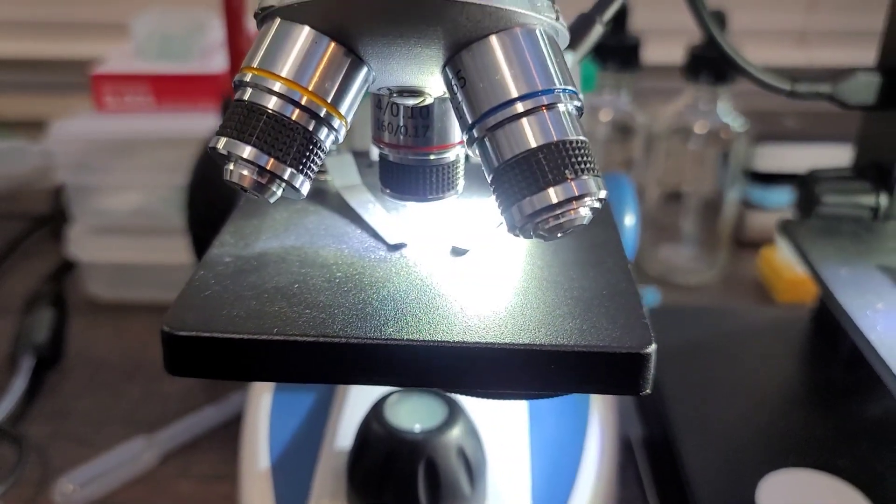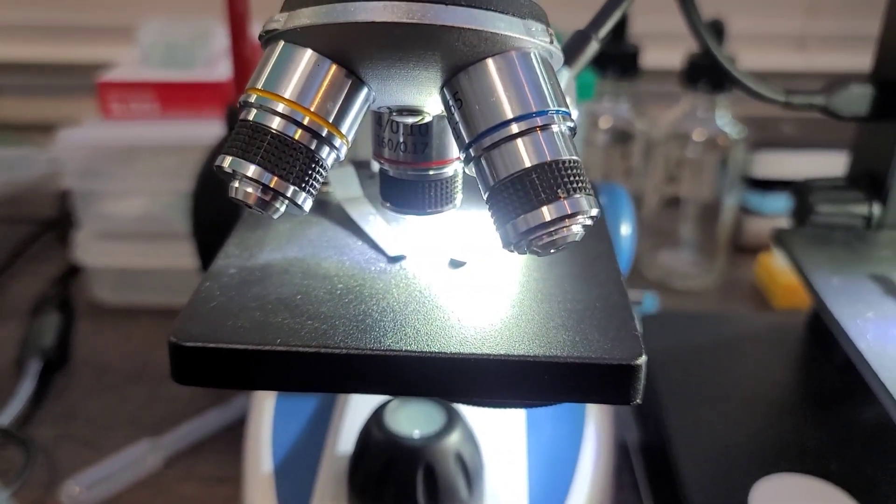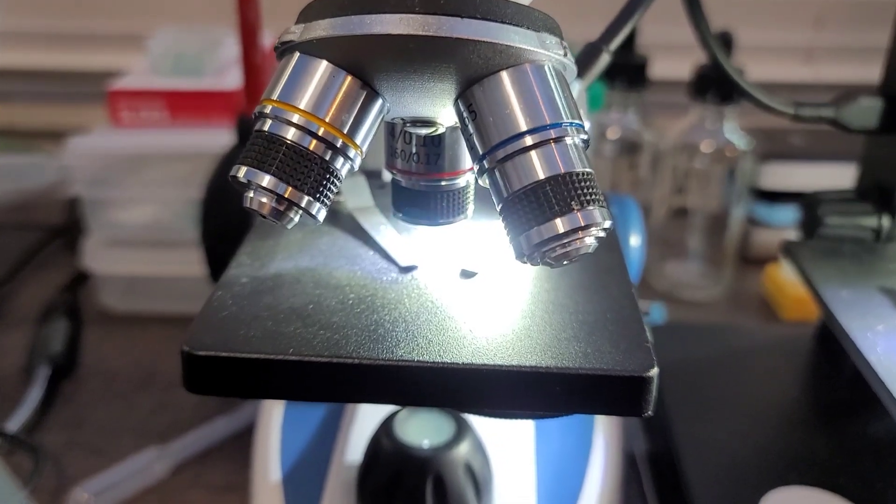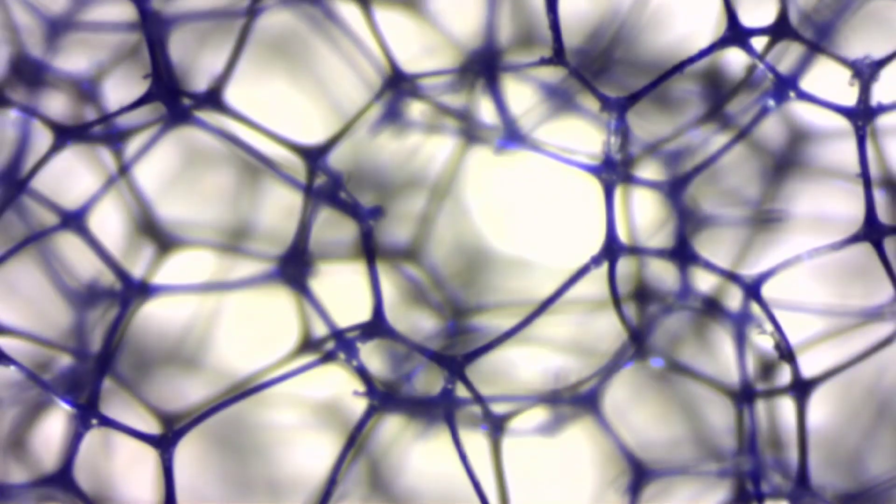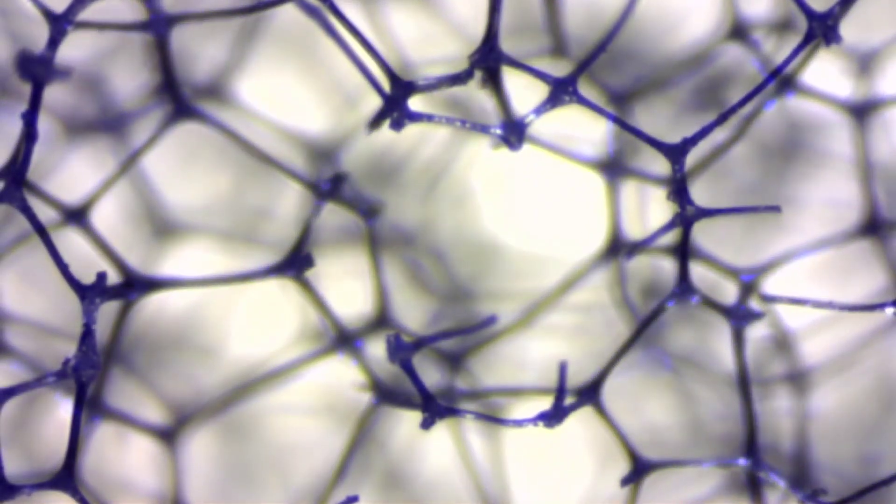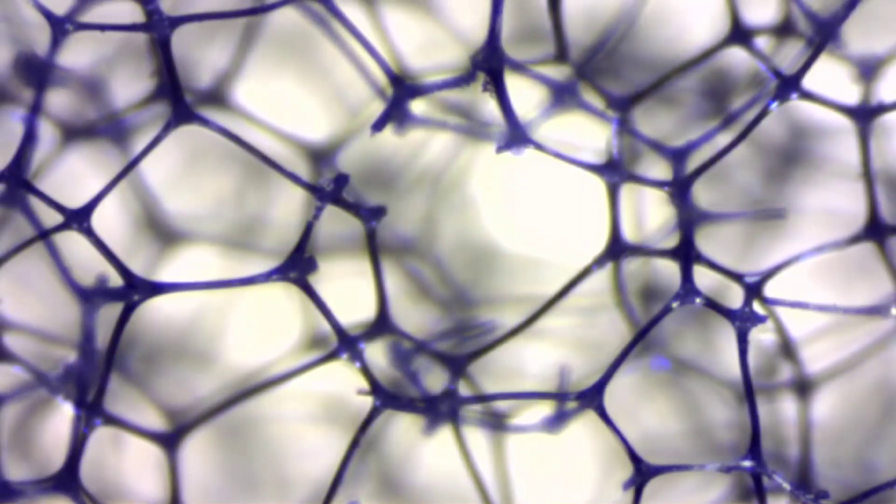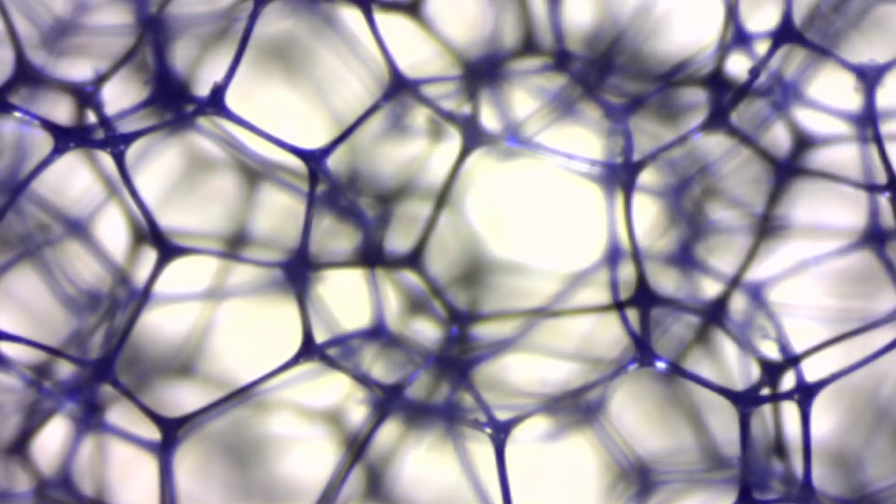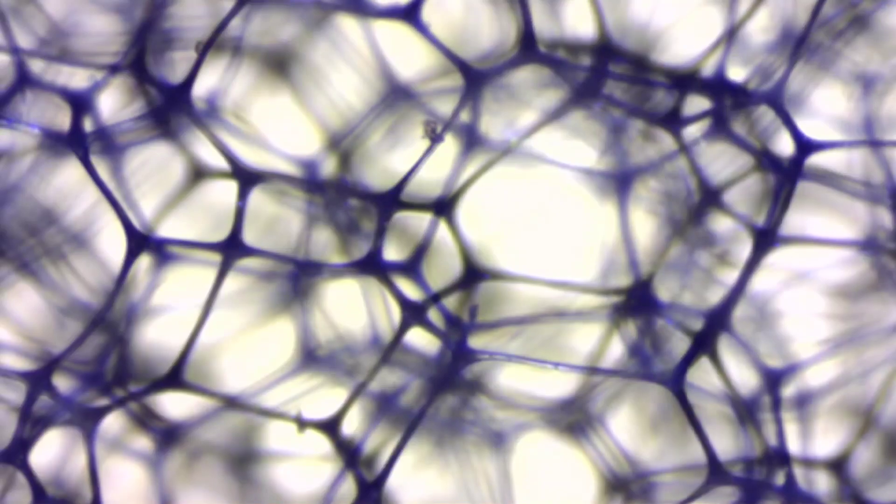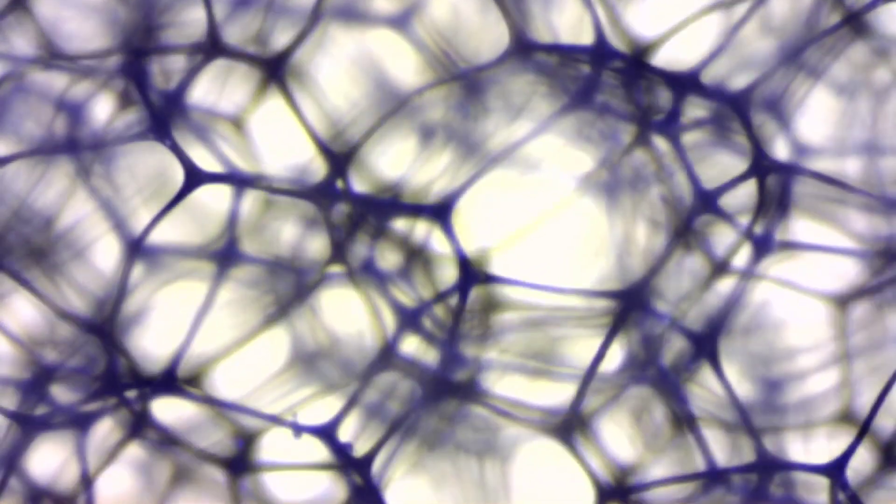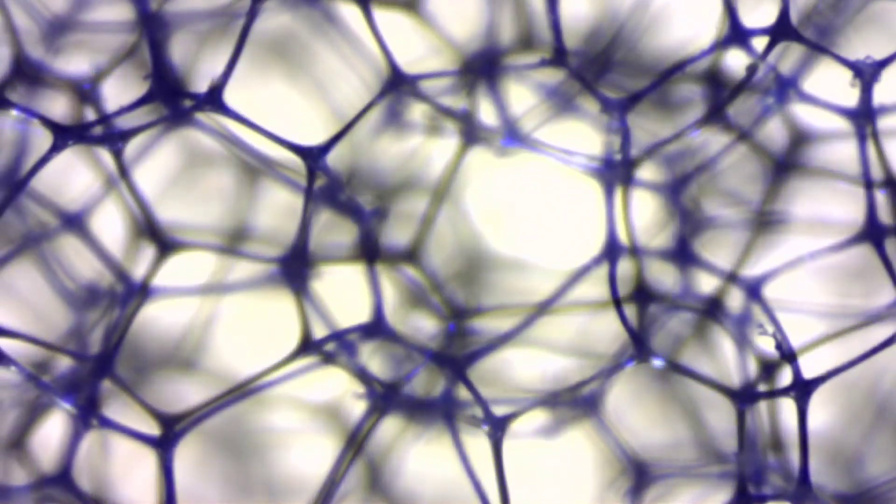So yeah, that didn't work. We'll move it over to the M scope. There we go, you can see a lot better now. The hexagon or octagon connections, see that? These are rated for hardness.